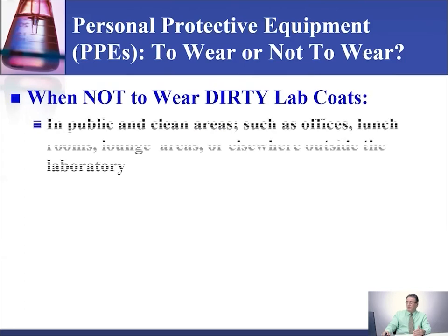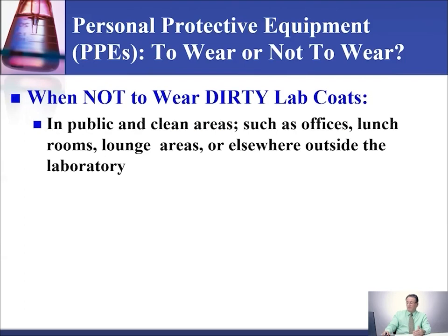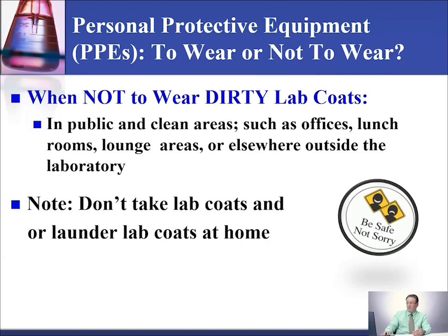When not to wear dirty lab coats in public and clean areas, like I told you earlier, such as offices, lunchroom, lounge areas, or elsewhere outside the laboratory. No, do not take lab coats or launder lab coats at home. Your employer should provide you a laundry service, whether in-house or outside.